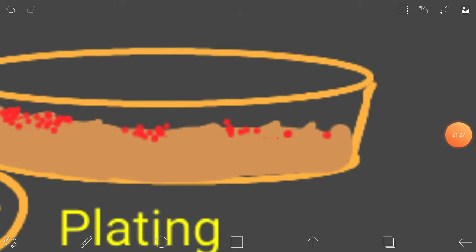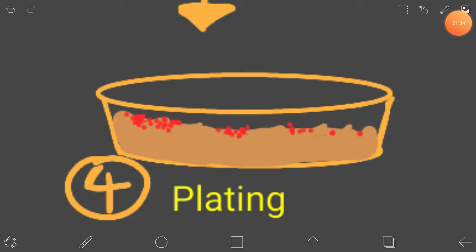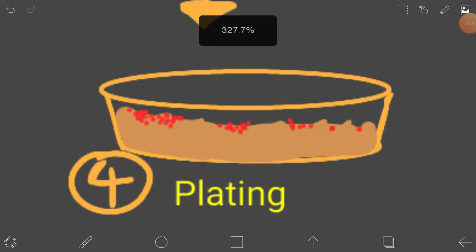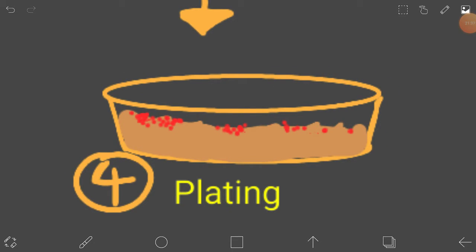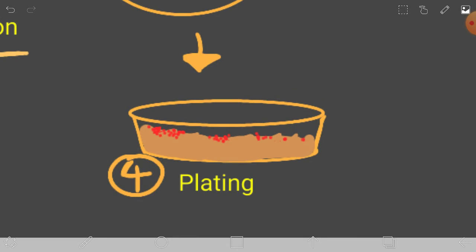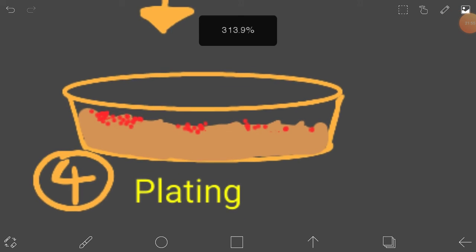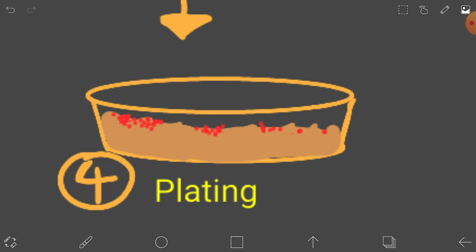Now when that's done, the colonies are checked whether they have the right plasmids, whether through PCR or restriction digestion. The colonies with the correct plasmids are grown in bulk so it could be used for plasmids or protein production.